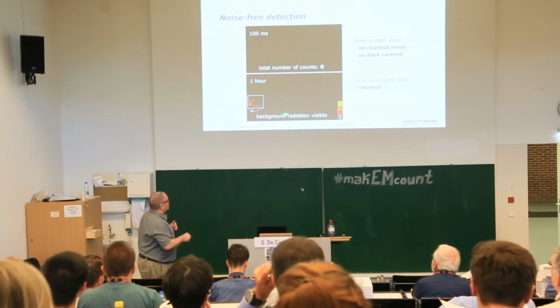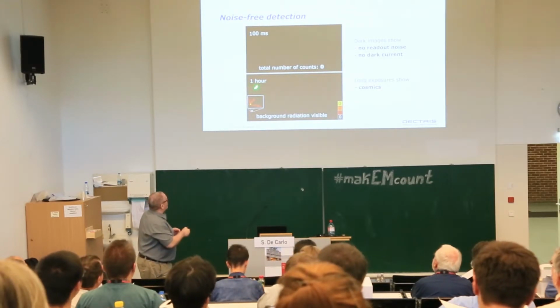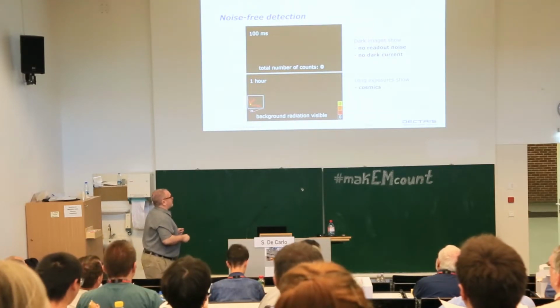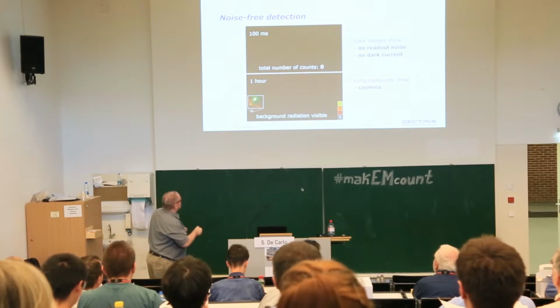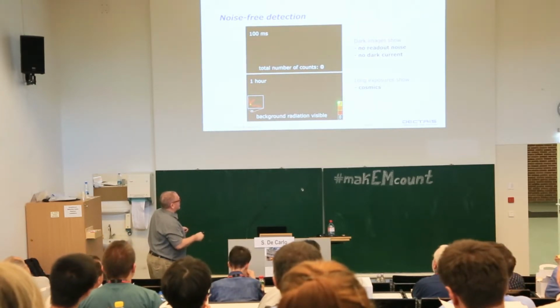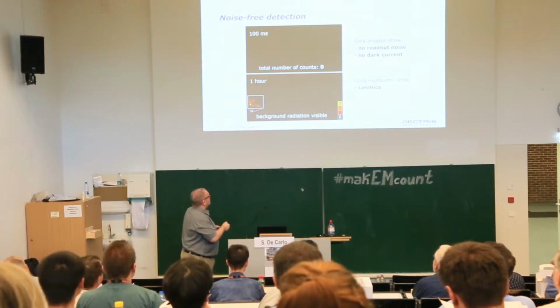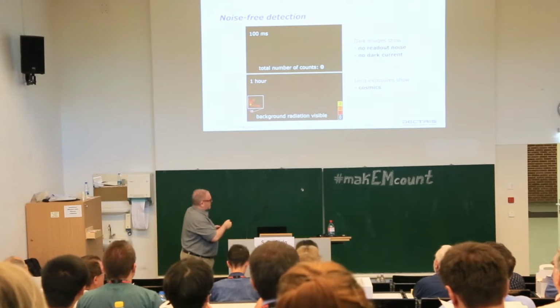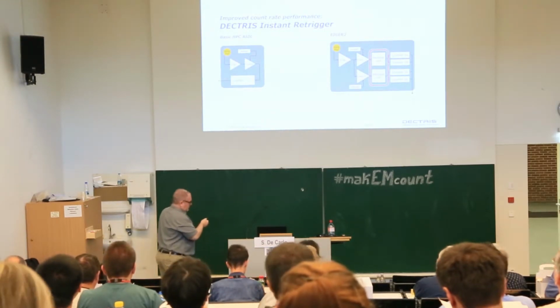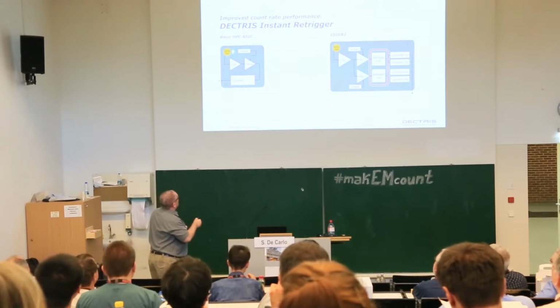Of course, if you allow your detector to run for a longer exposure time, you record cosmic radiation. But you can see here in the inset the type of traces which are created by cosmics, and it's very low counts, background, which can be eliminated by applying a threshold. So this is the general structure of the basic hybrid photon counting.